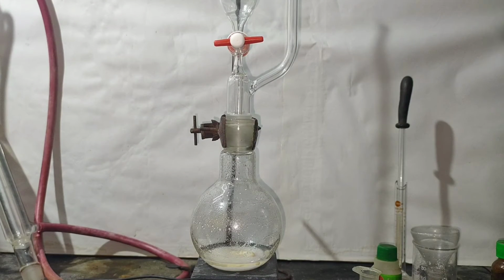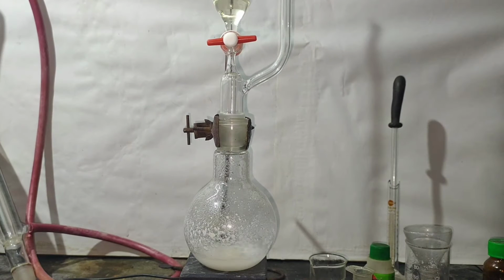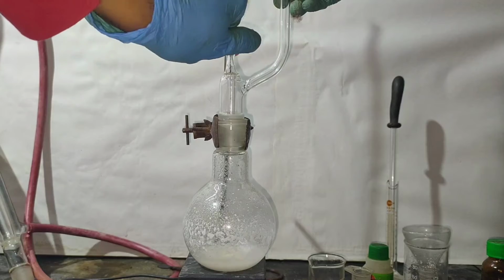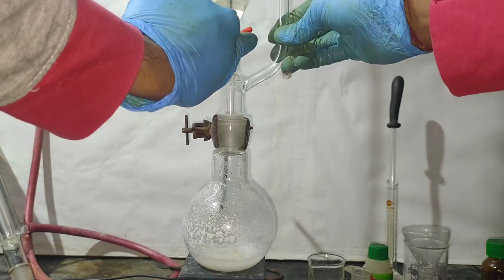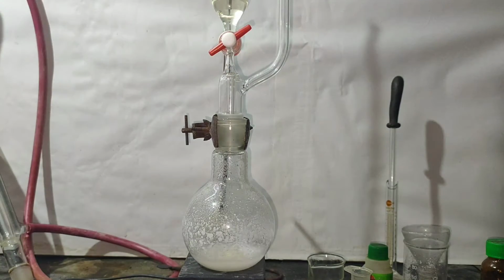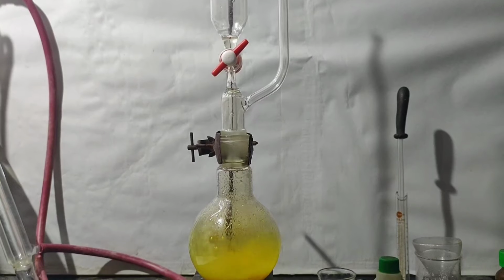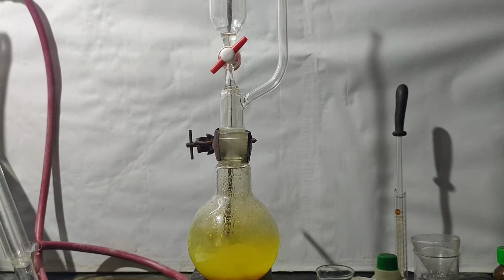Then I placed a pressure equalizing addition funnel and poured the prepared nitrating mixture into it. Then stirring was turned on and the nitrating mixture was dripped in slowly. After some time, the mixture became yellow.